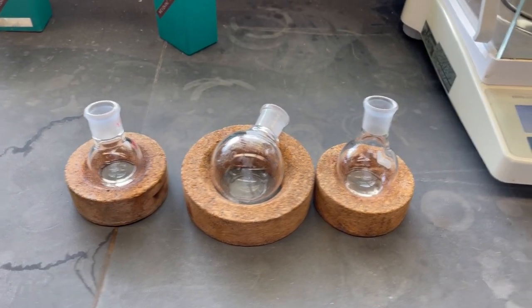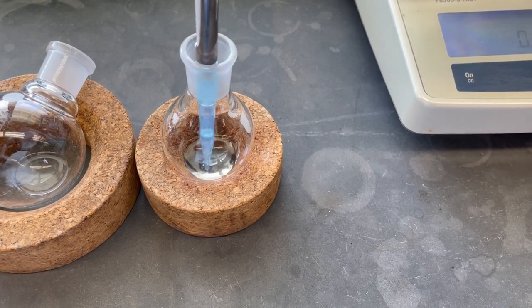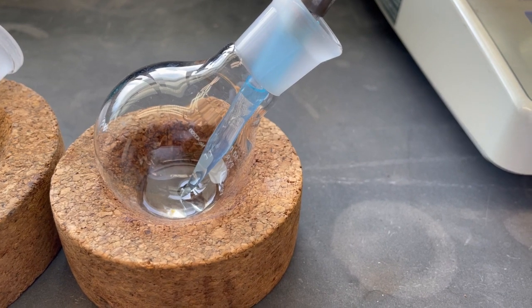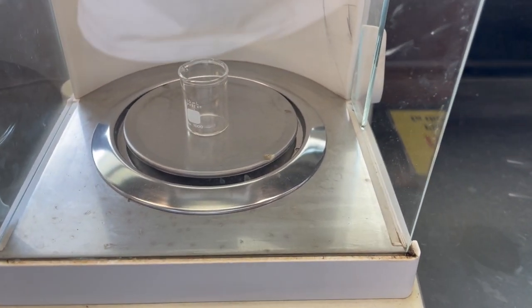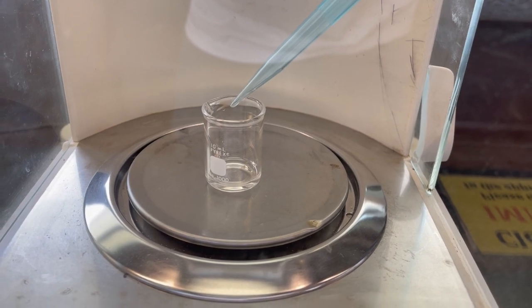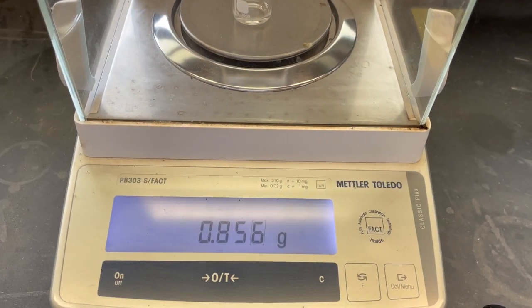All right, so here's number 1, 2, 3. Get that one first. That's not even a mil. Let's go ahead and angle that, so that way we actually get our sample in there. Go ahead, open this up and transfer. Oh, check it out. 0.856. Write it down. Okay. That's the first fraction that we analyzed.